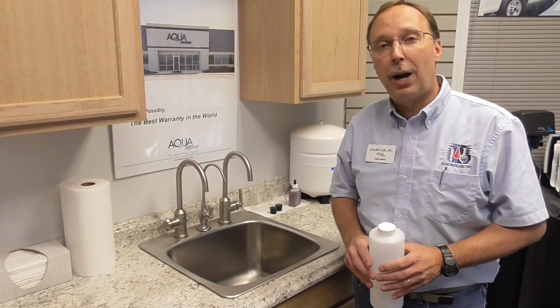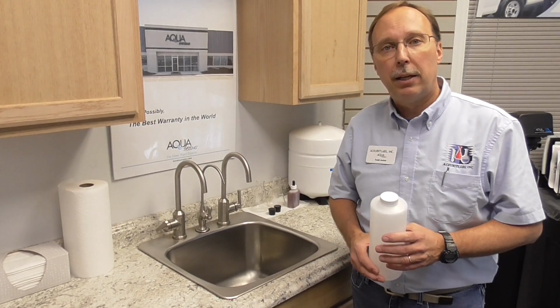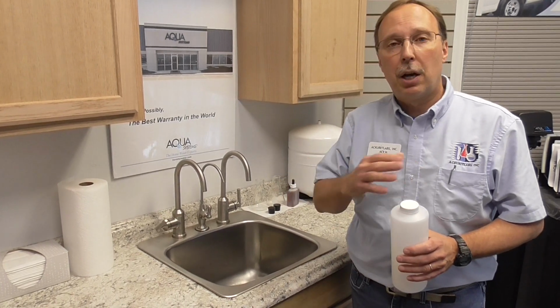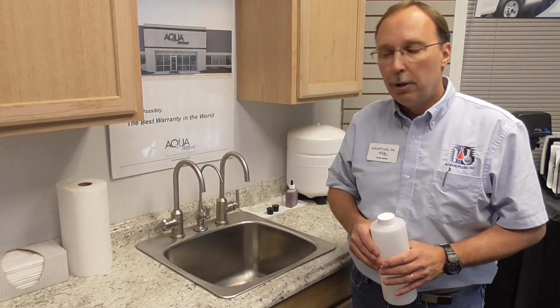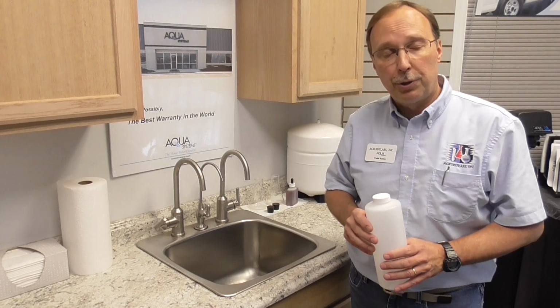I'm the lab director for Ackuritlabs, and today I want to talk to you about sampling your water for lead. Typically, in drinking water, the lead does not come from the groundwater; it's leached from the piping system that supplies water to your home. So we want to check the water for lead. The EPA's got fairly strict protocols for sampling for lead.